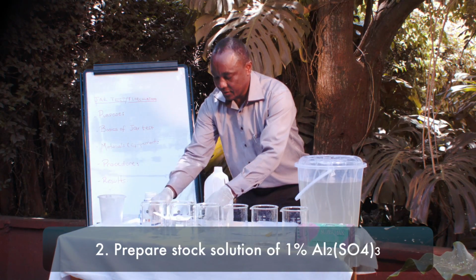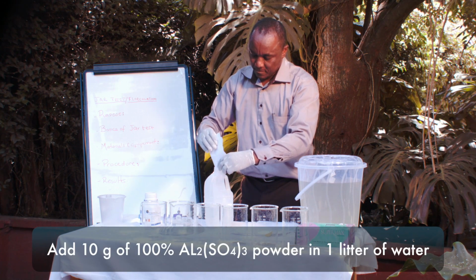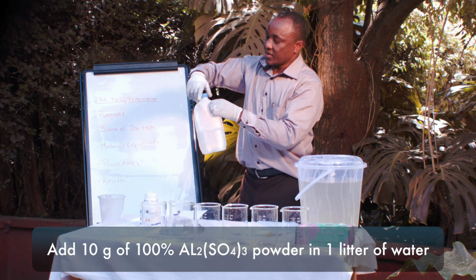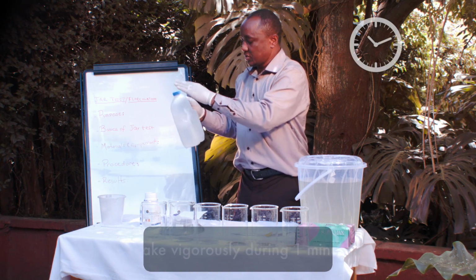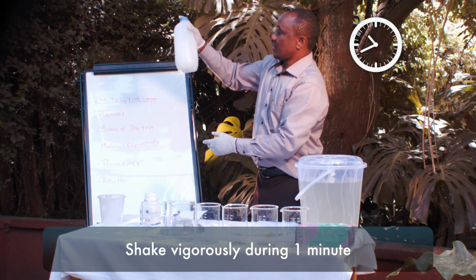And slowly I put the aluminum sulfate powder. Okay, then after that, cover the jerrycan and shake it for 1 minute to make sure that the solution is made for thorough mixing.